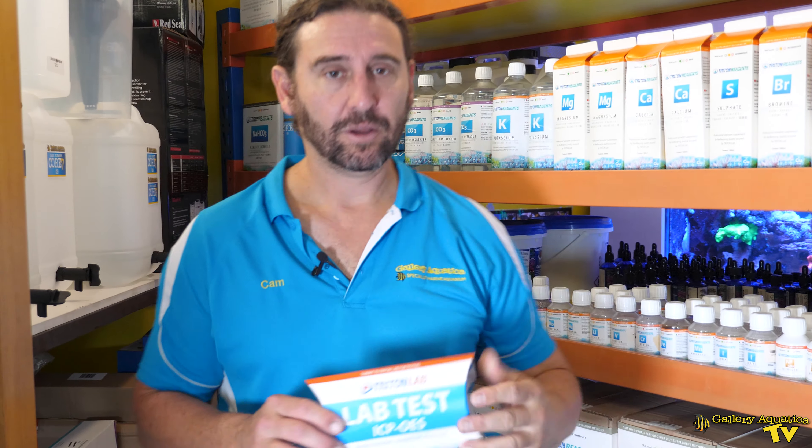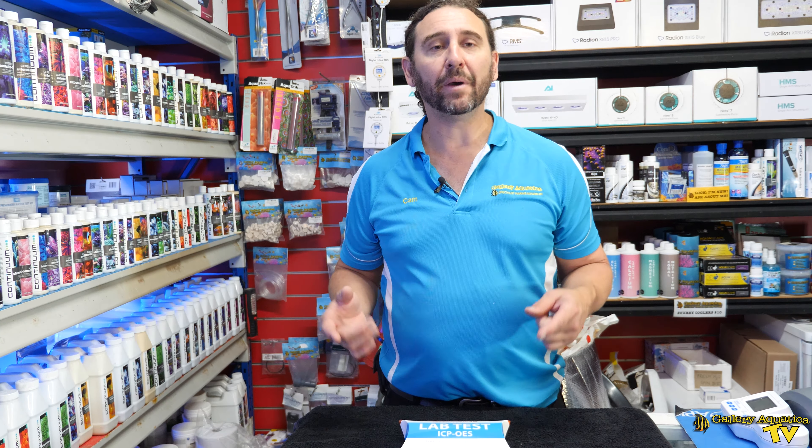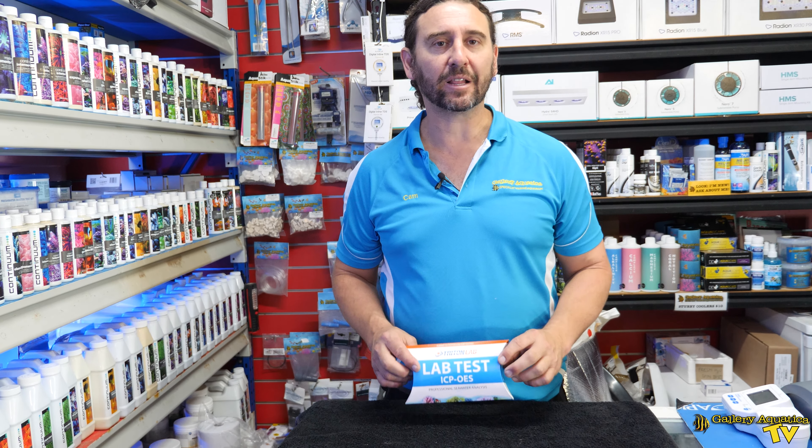When you do an ICP test, the first thing you need to do is purchase the test. We have our ICP test here and this is a kit that contains everything that you need to send off a sample to the lab. We're going to open this up and show you exactly what you need to do to process your ICP. Let's open up our Triton ICP and show you exactly what you get.